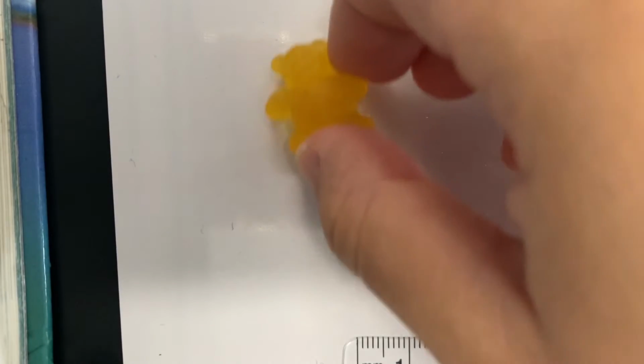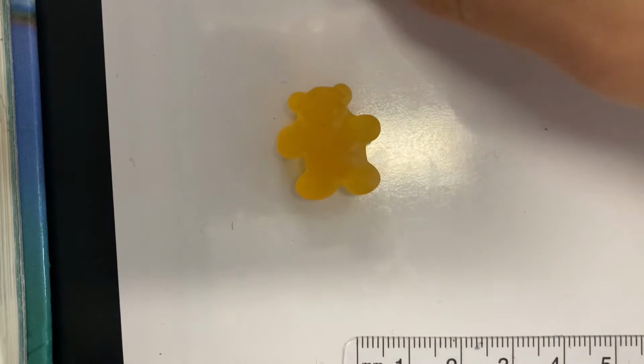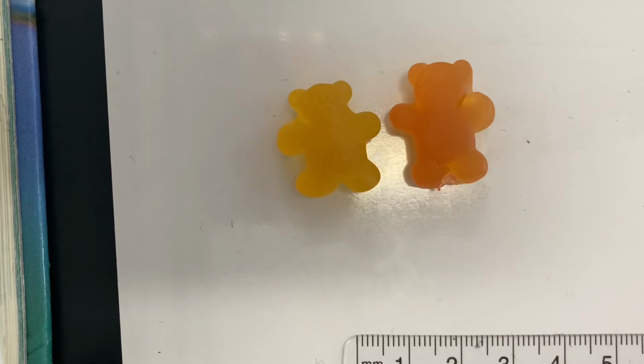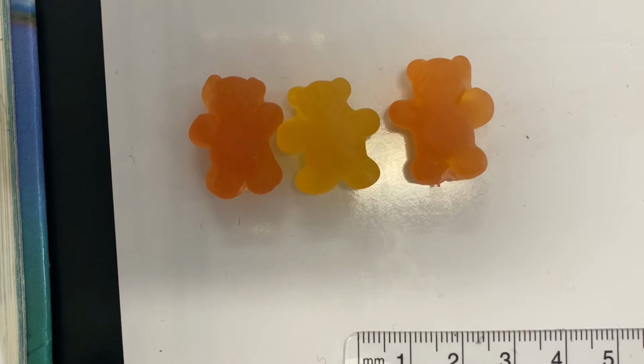Now we have 3 gummy bears here, and we're going to be putting them into different solutions. The procedure, and hopefully you have a copy of this, says that 1 beaker is going to be filled with distilled water. 1 beaker is going to be filled with salt water, and the other beaker is going to have nothing in it but the gummy bear.